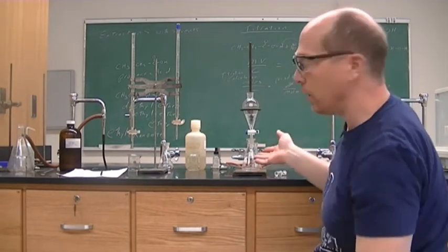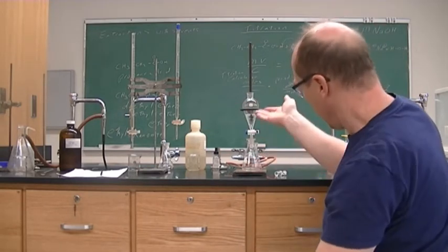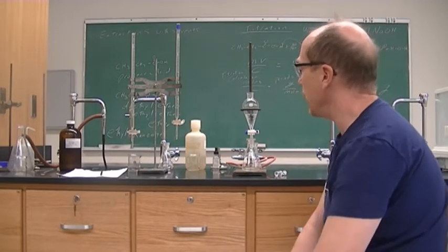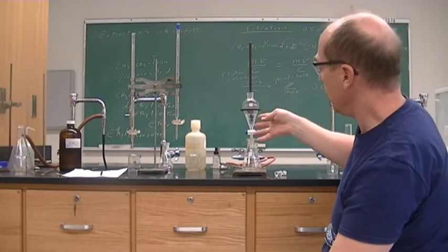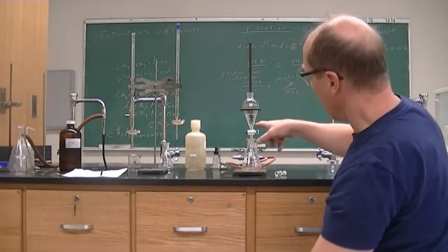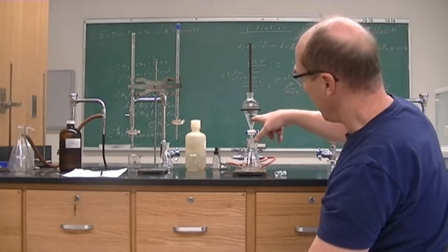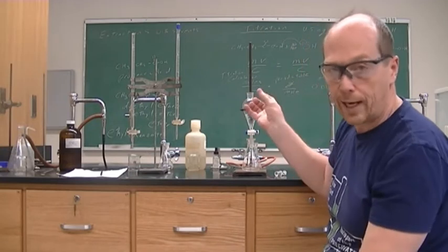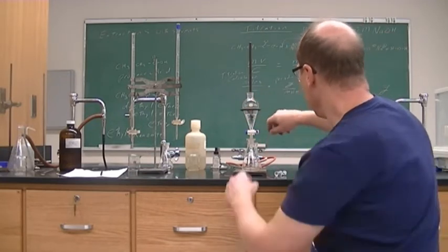We're going to collect our aqueous layer with the acid in it, and then we're going to titrate it to see how much acid we have left in the water layer. The remaining acid is in your organic layer, the ether layer.